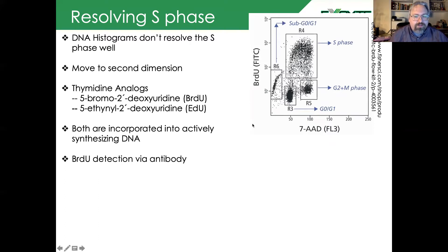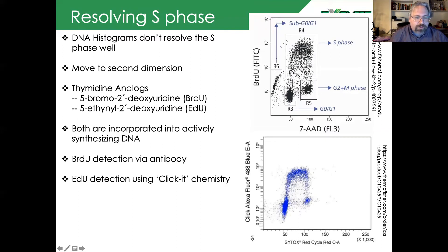Here is an example of BrdU versus 7-AAD. Here is our G0/G1 peak. Our BrdU-positive sample shows our S phase very nicely, and then we get to our G2M peak. If we look at the same results by EdU, we see a similar pattern: G0/G1, S phase, G2M.